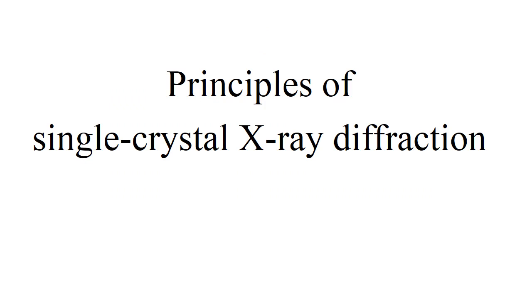Before this, we have discussed the single crystal X-ray diffraction, how the diffraction pattern of X-rays for a single crystal is obtained. Now here are the principles of single crystal X-ray diffraction.